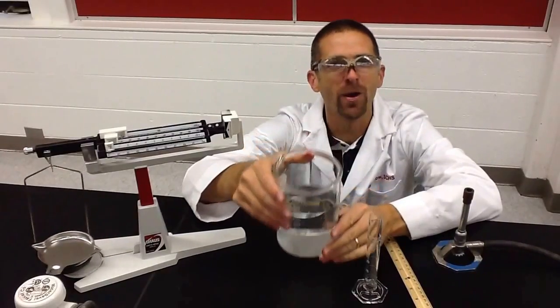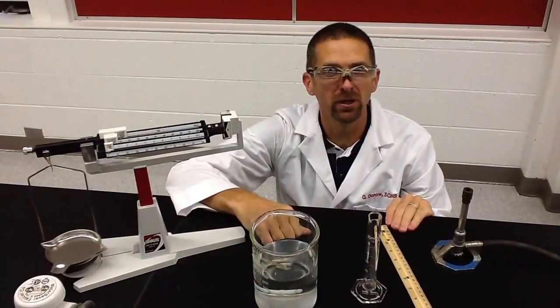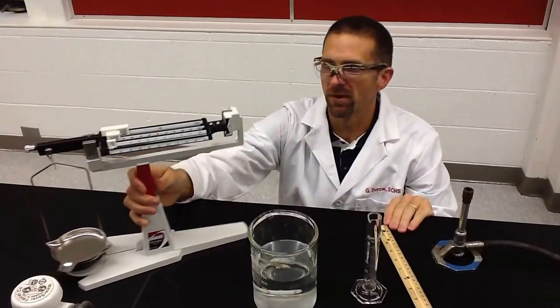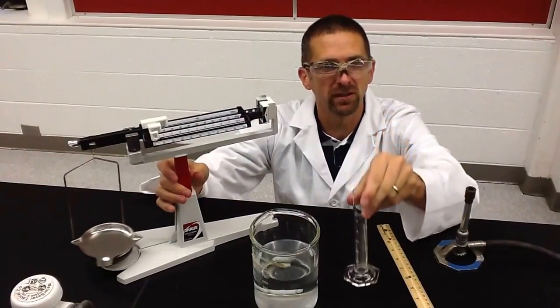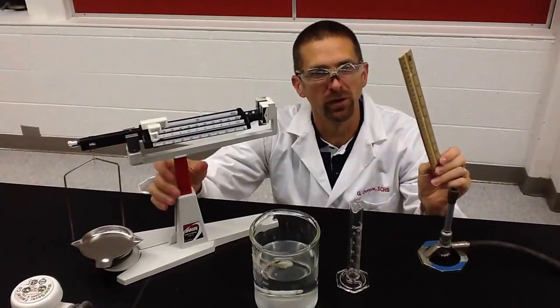Eureka! Oh hey, it's Mr. Doro. Today I'm going to be talking about some equipment that we're going to use in chemistry this year. One of them is the balance, the graduated cylinder, the burner, and the centimeter ruler. Stay tuned.